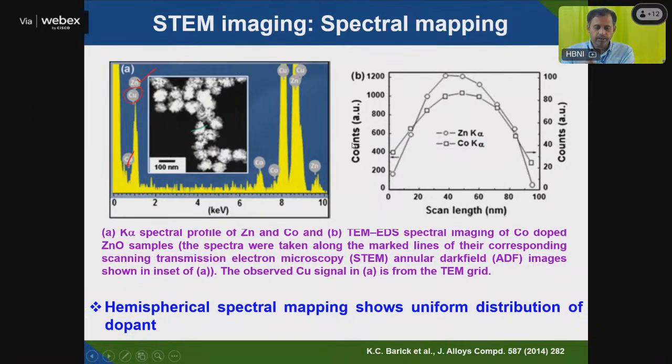Yeah, you can get that different. As you know, copper grids are made up of various mesh. Most of you have seen copper grids. They have small squares. In this square, you have a carbon coating on the top surface. On this carbon coating, you put your drop-cast sample solution, and then the copper signal or carbon signal will mainly come from the copper grid and carbon coating.